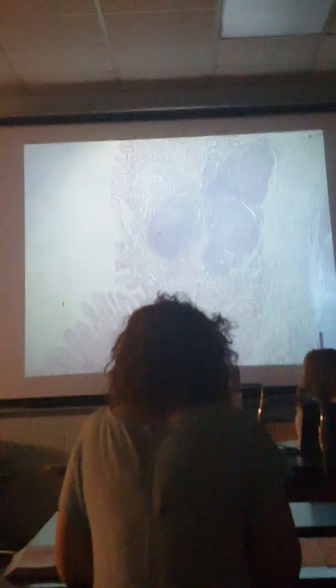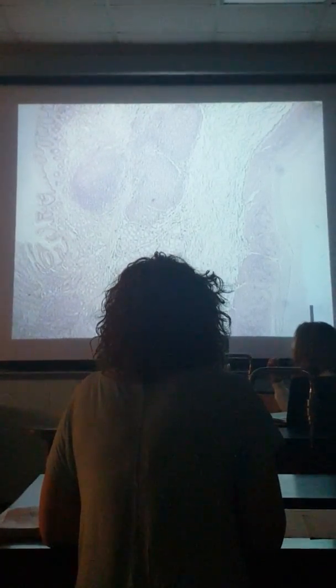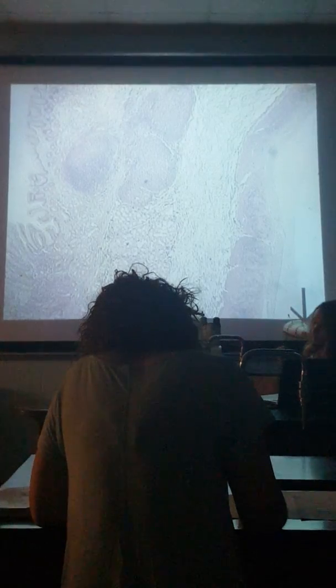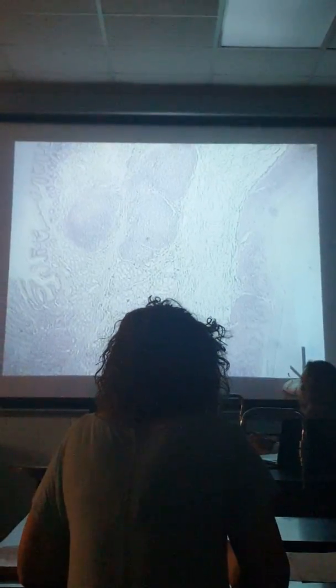So that's the end of the stomach. We're going into much more breaking down, digestion, and a lot of absorption, due to the physiology. So what sphincter are we at? This is the pyloric sphincter, the transition from stomach to duodenum. This has got to be pyloric sphincter in cross section. Any questions? So that's esophagus to the upper part of the small intestine. Tomorrow we'll finish off with small intestine and the rest of the GI tract.